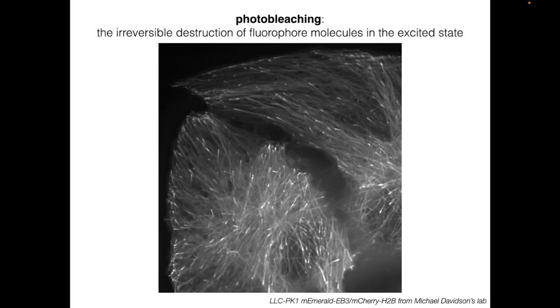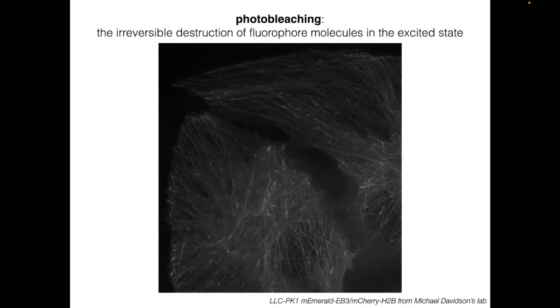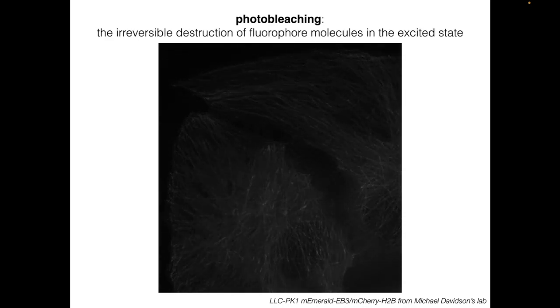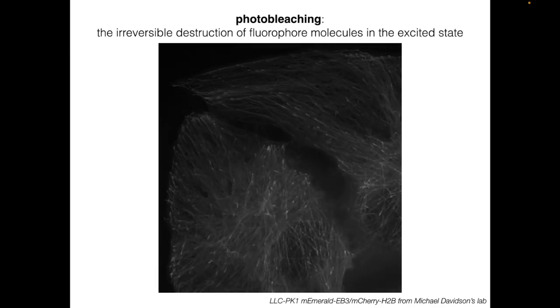Here is an example of a sample photobleaching. These are LLC PK1 cells expressing an mEmerald-tagged EB3 protein, imaged on a spinning disc confocal microscope. As the time lapse proceeds, the image gets dimmer as mEmerald molecules photobleach. Note that the video is playing on a loop — when you see the signal come back, that's the video restarting. The photobleaching itself is irreversible.